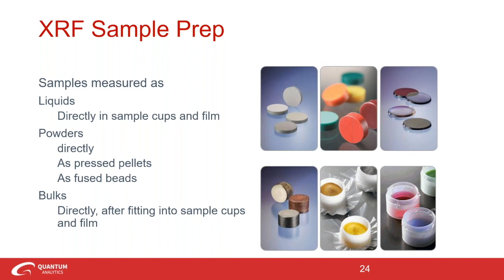You can do a pressing like hydraulically or manually. There's these presses that you can use that compacts the sample more into the analysis area and ensures that you have uniform density and you get better reproducibility. So that's really, really helpful, especially when you're working with these powders. You know, the more sample prep you can put into it, like some of the pictures you'll see here, how they'll press these pellets of powders.